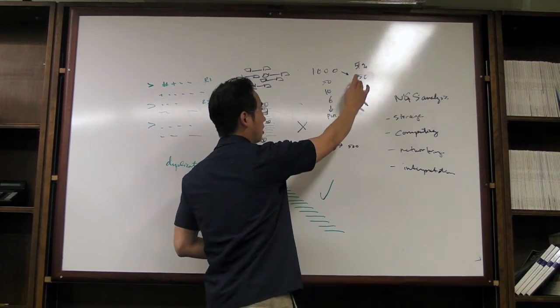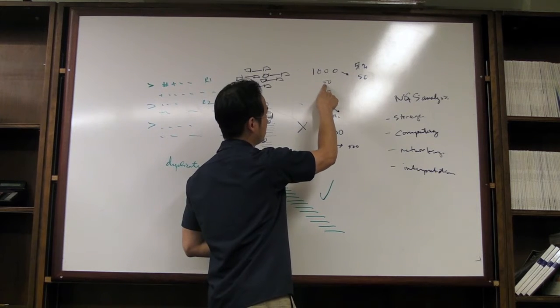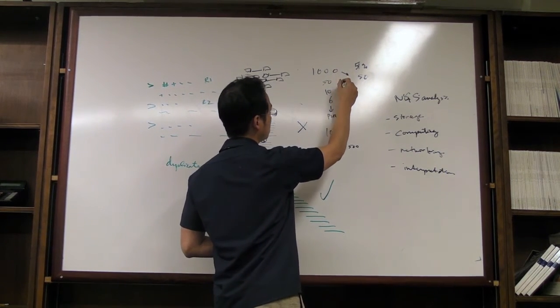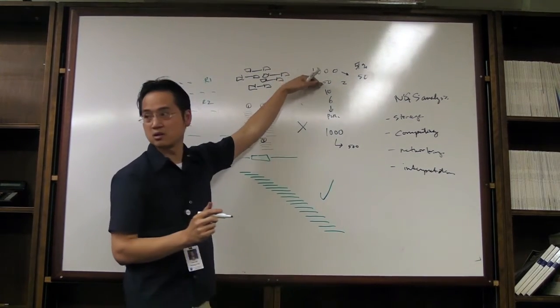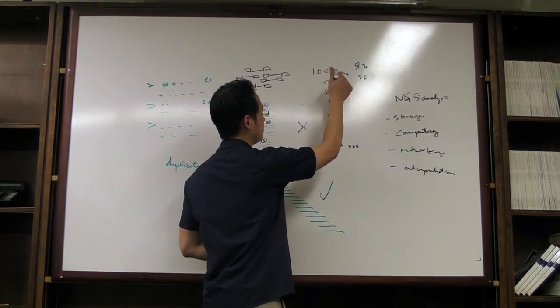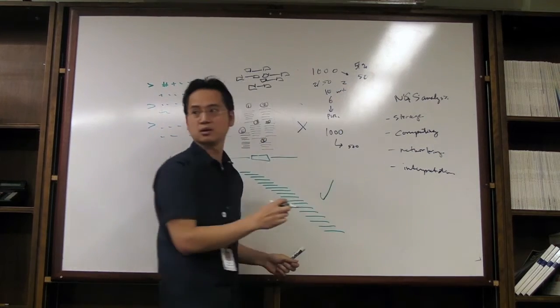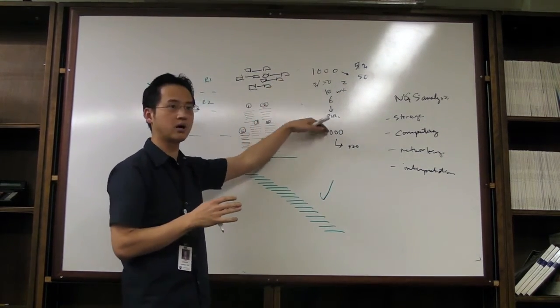If you sampled correctly, then those 50 that you captured will probably only pick up what? Maybe 2 reads that show the mutation. And so if you keep losing things along the way, what can happen is that those 2 out of 50 will get lost here, right? And then now all you have is wild type only. So what you want to do your best is maintain complexity throughout the entire process.